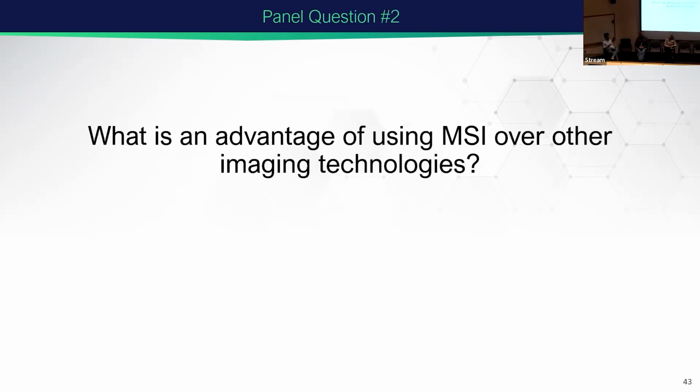Yeah, and that's actually where a lot of these methods are bridging into the antibody-based, bringing it to the actual mass spec detector instead of using the microscope, because it is such a powerful molecular microscope in its own sense. So it's a very good perspective within that too.